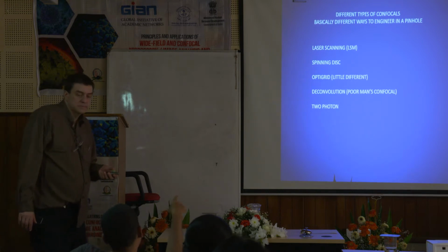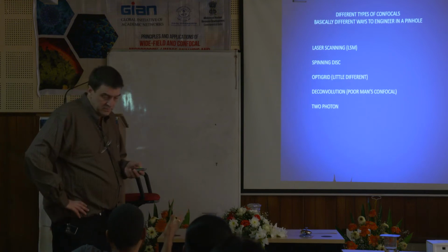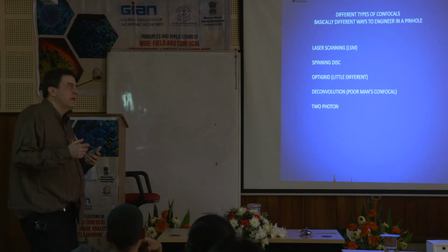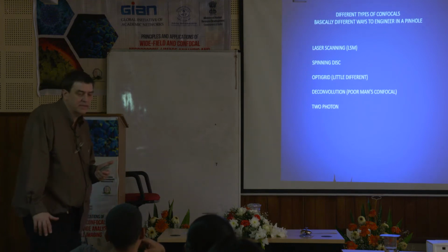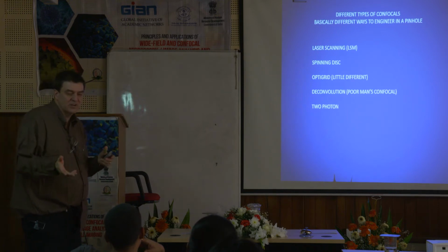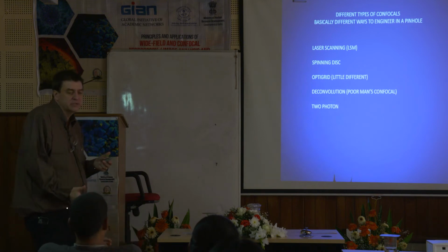Okay. But in the deconvolution, yesterday we discussed in the wide field, right? But there was no pinhole in the concept. There is no pinhole, exactly. You're using, in a way, you're using math to create a type of optical section. Okay. So it's a type of confocal, I guess, in a way, but it's really not confocal. But it sort of falls under the same category because it gives you like a confocal-like image.